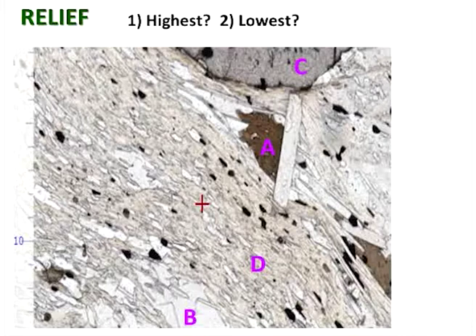So D takes up much of the slide here, this mineral D. But if you look down into this corner where I've labelled the B, you can see that the edge of that patch of very, very clear mineral actually does have a definite relief compared to the rest of the D mineral. So on this right-hand edge, you can definitely see that the clear B mineral looks as if it's kind of set in, it's lower down in the slide, and the D mineral looks as if it's kind of embossed. And that's what we mean about the relief. It looks like it's sort of standing slightly proud of the B mineral. So that's absolutely right. The B is the lowest.